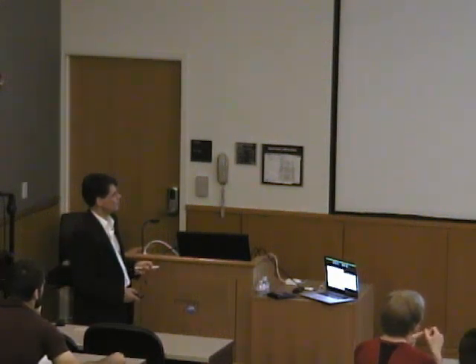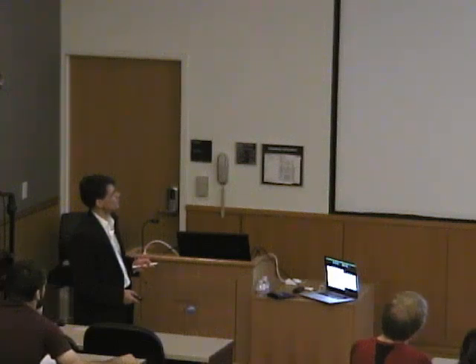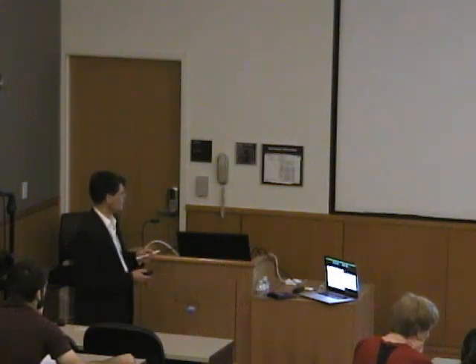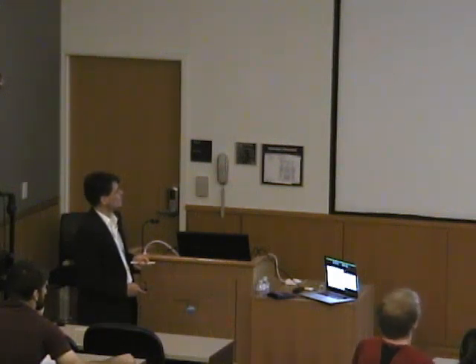However, the MCD doesn't even try to make this transition. The MCD makes a transition to an excited state that is orders and orders of magnitude higher in energy. And so what you observe here are the transitions from the ms equals 0 component of the electronic ground state to the ms plus minus 1 components of the electronically excited state, and that is always possible. So whether you have an integer spin system or a half integer spin system does not matter to MCD at all. Okay, so that is great.